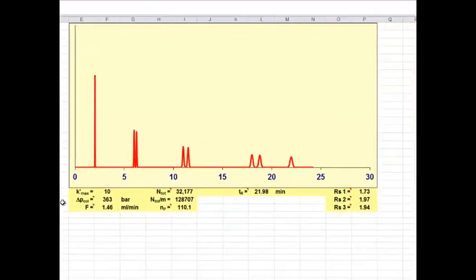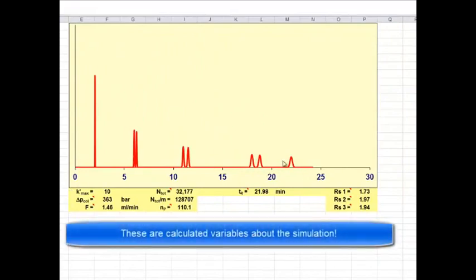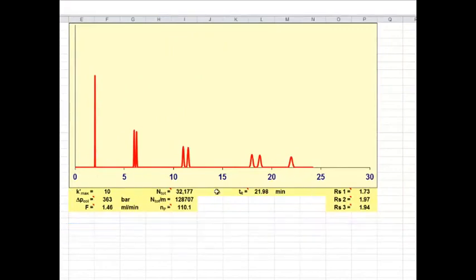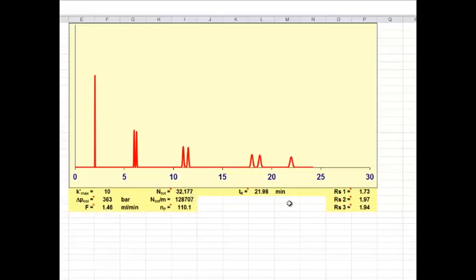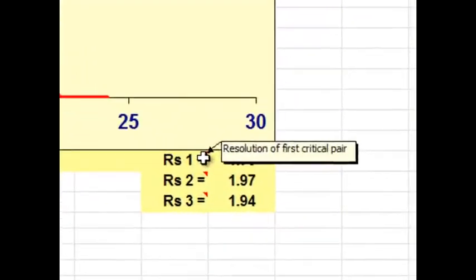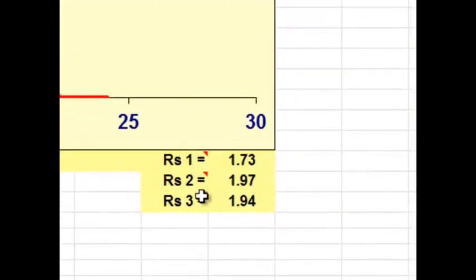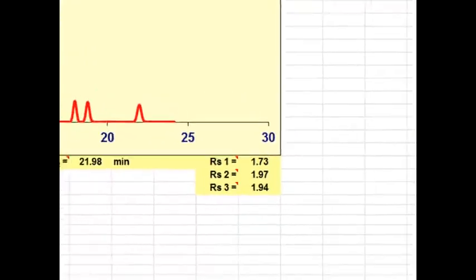And then you see in the yellow, the chromatogram, and below are things like the maximum capacity factor, which must be this peak way out here, minus the retained T sub m divided by T sub m. The pressure of the column is also calculated. Remember, you need to keep that below about 1000 bar, ideally 400 bar for a typical system. The flow rate, the number of plates, the retention time, I think of the max peak, and then the resolution 1, 2, and 3. And it tells you of the first critical pair, second and third.